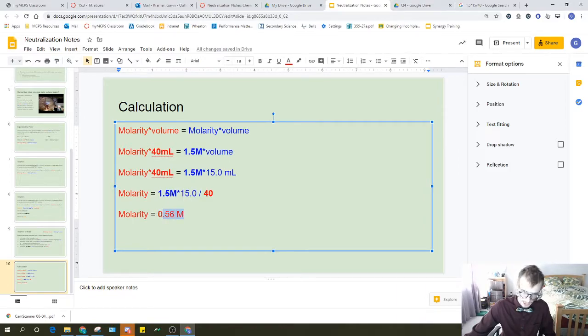Basically what this is saying is that this acid sample, before I added the base, must have been the concentration of the acid when it started. Because I took that sample from the stream, I mean, of course, this is a made-up lab example, I can assume that the rest of the water in the stream is going to have that same molarity. With that information, I can go ahead and do some more advanced chemical engineering math to come up with a solution that involves neutralizing that acid. But the math is going to look a lot like what we just did here.